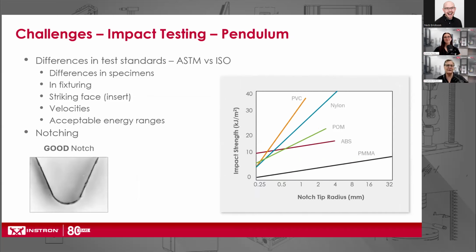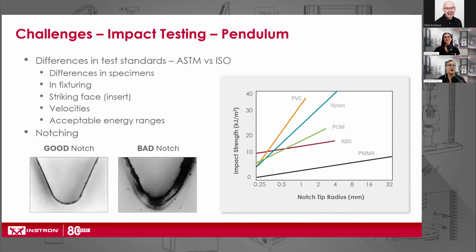Notching, because these tests are dependent on the notch. If you get a good notch, as you see on the left, a nice clean notch, you get good results. If you get bad notches, then that affects the result. It affects the impact energy, the values that are important that you're looking for.